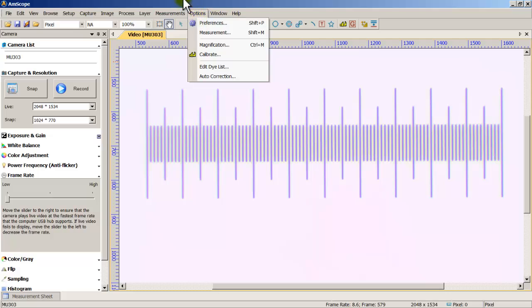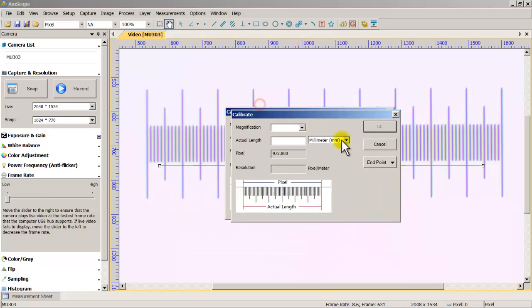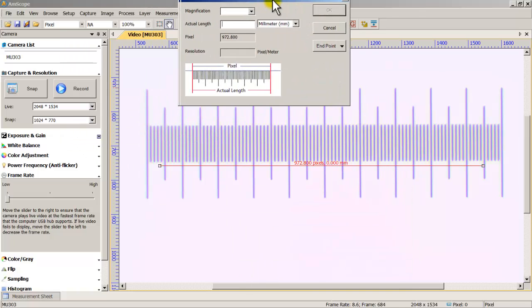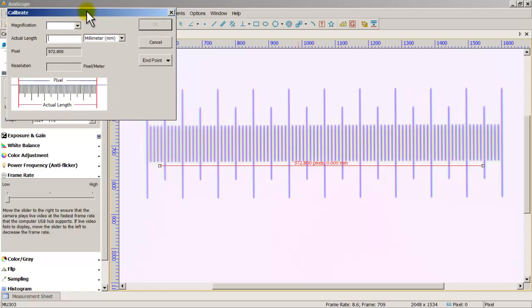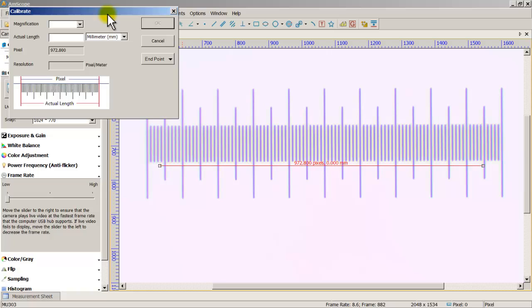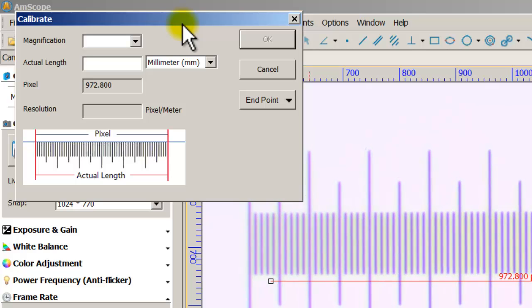Go to Options and Calibrate again. After you click the Calibrate button, it brings up the Calibrate box. I'll move it out of the way so you can see. There's a calibrate box, and you'll see a long red line on the screen. This red line dictates the actual length that you will enter in the box — whatever you measure with this line is what you put in the Actual Length field.